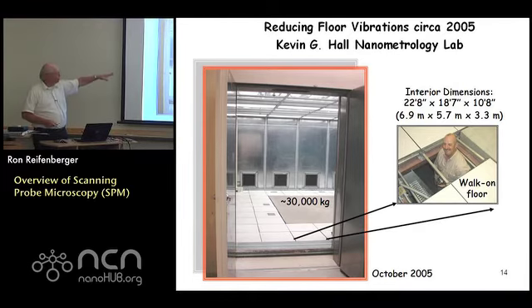You move to Burke and you put your instrument on this slab and you've got 24/7 operation. You can come in any time of the day, any day of the week, and you're guaranteed that the vibration isolation is going to be good. So this is a big breakthrough for us that we're doing scanning probe research. But it requires a building like Burke, right? You can't retrofit this type of vibration isolation slab into an existing building. You can do it, but it's extremely expensive. It's better to design it with the building, and that's what, fortunately, we did here.